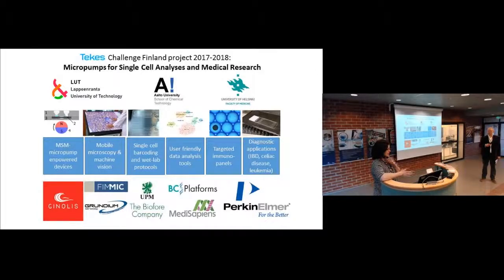But I think the sequencing costs are also still quite expensive. So usually people can't afford to sequence more than a few thousand cells per experiment, because the Illumina sequencing is otherwise too expensive. But hopefully Illumina lowers the price at some point, so that the sequencing price is not the bottleneck anymore. Then I think there's good place for these very high throughput devices, with capturing of hundreds of thousands of cells and making libraries of them. But it's all about money at the moment.